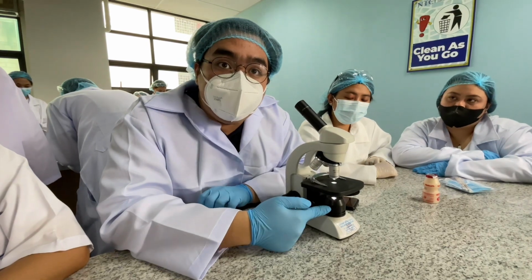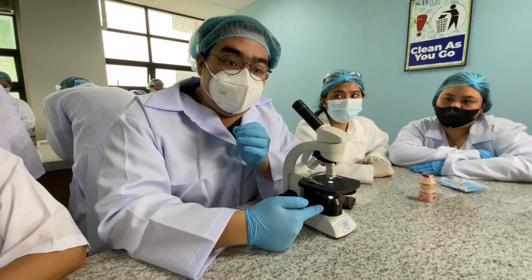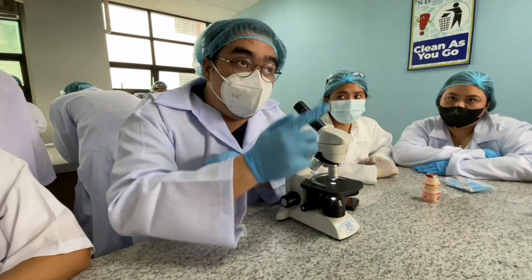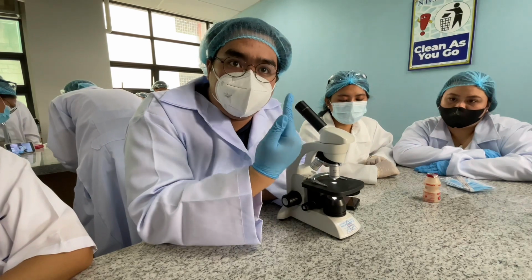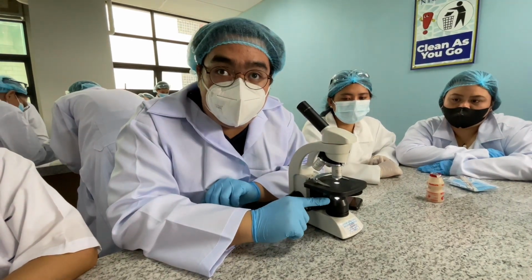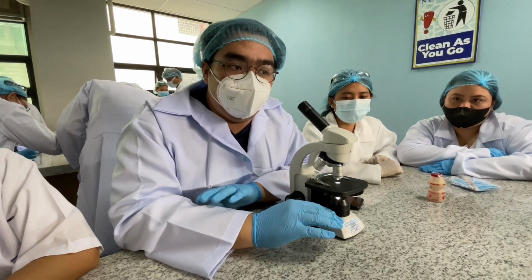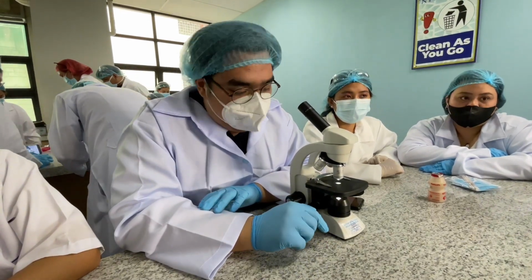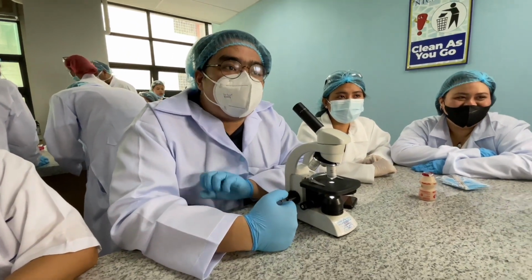Now, in your typical light microscope, the illuminator consists of a simple mirror in order to reflect light from our source and towards the lens so we can see our specimen. But here, there's already like a flashlight in it, so there's no need to find a light source to observe it effectively because your light source is already there. So yes. Thank you.